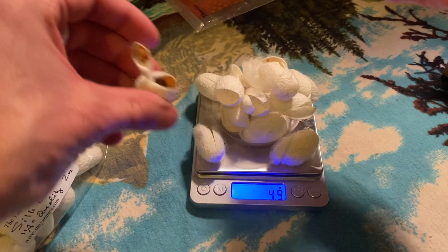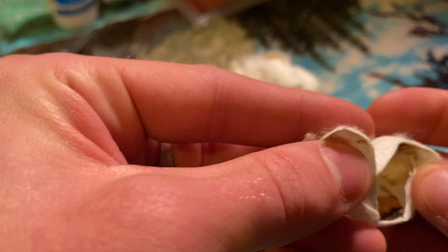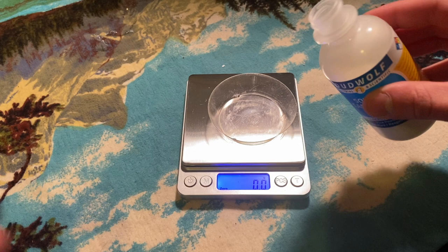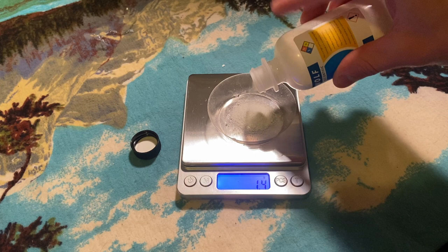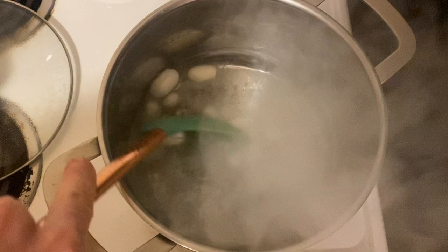The cocoons need to be washed into a more fibrous consistency, as clean as possible and ready for incubation. I weighed out 2.1 grams or so of sodium carbonate — I couldn't get exact significant figures — to make a 0.02 molar solution in 1 liter of water. Most of the water evaporated, so I didn't boil them for the full 30 minutes; I added another liter of water before washing.